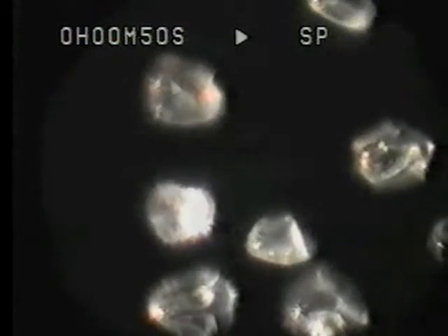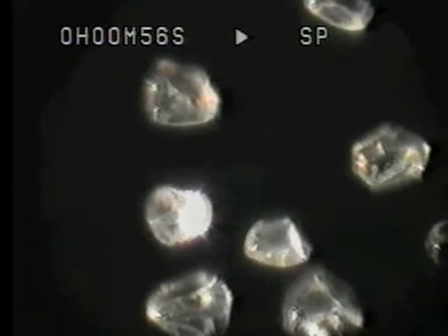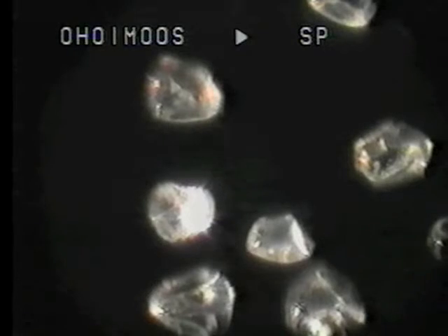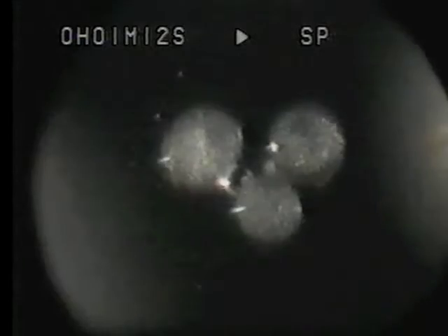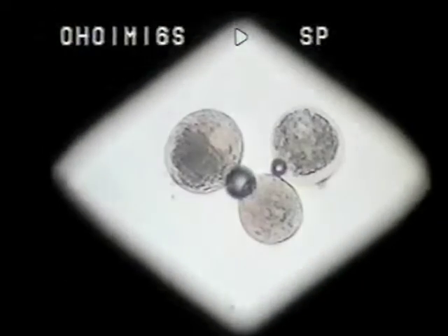Now this is Cocksfoot pollen, lit from above by fibre optic light. And now we are going to drop a little water on it with a cover slip on top. Now we have dropped the water on. Immediately the pollen grains swell up — we will put the bottom lighting on.